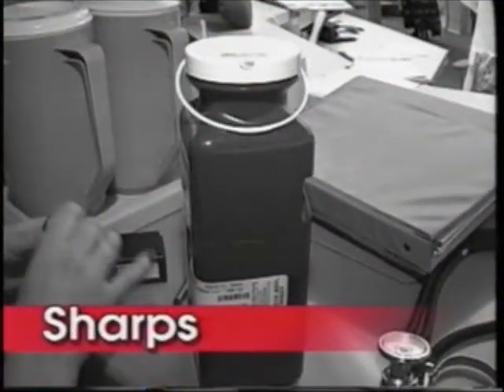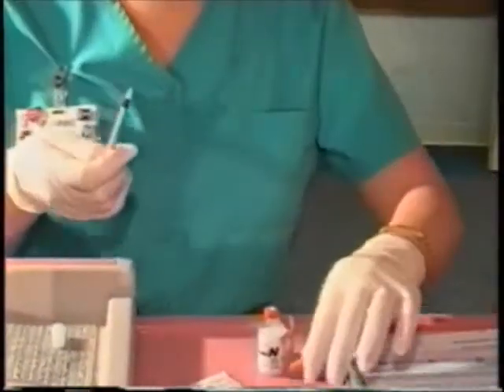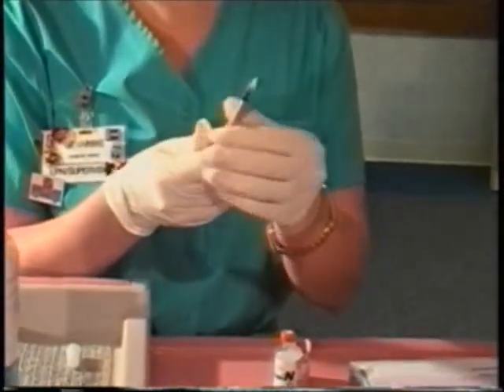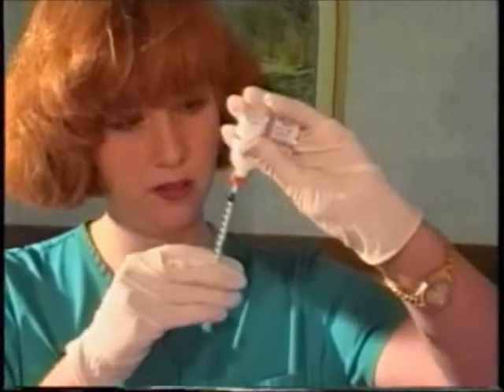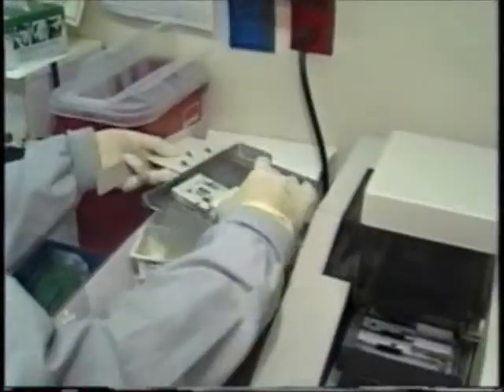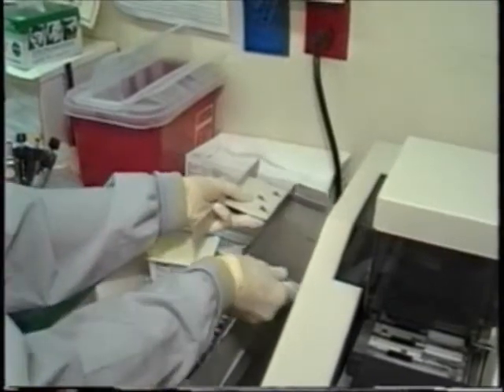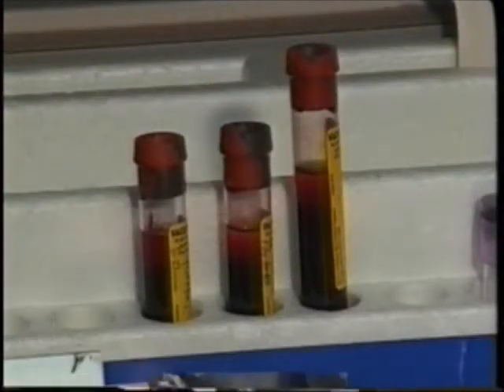All healthcare workers should take precaution to prevent injuries which may be caused by sharps. Sharps are defined as materials that are capable of puncturing, lacerating, or otherwise penetrating the skin. And because there is this danger of puncturing the skin or penetrating the skin layer, they need to be put into an approved sharps container. Needles and syringes with needles attached, and contaminated hard plastic or glass objects that are broken are just some examples of sharps.